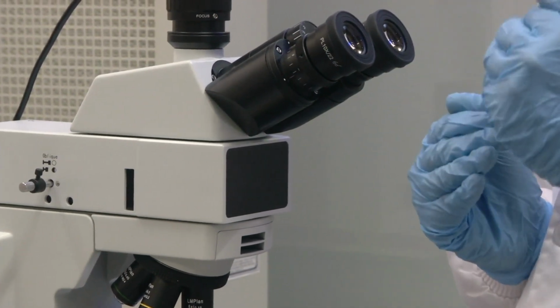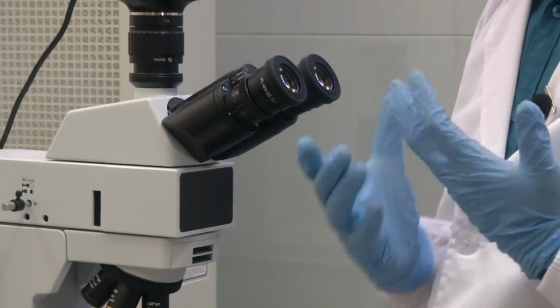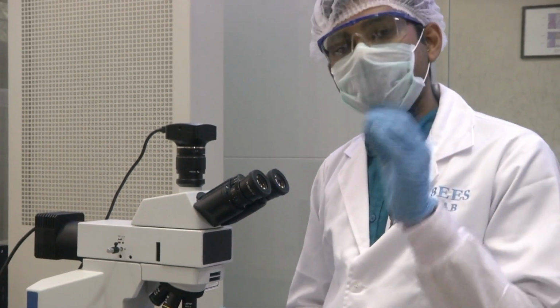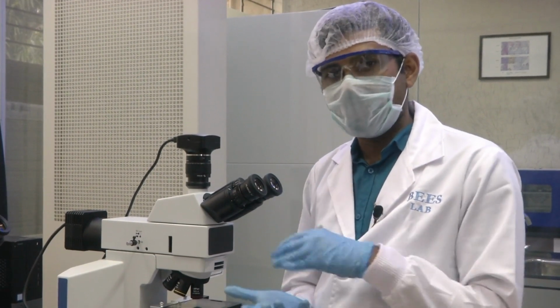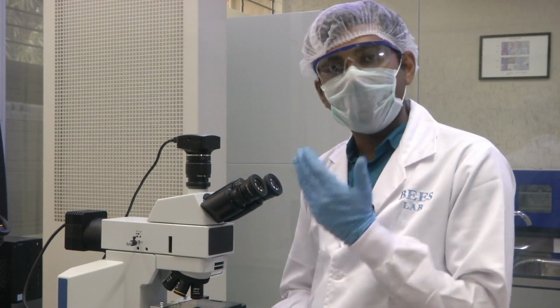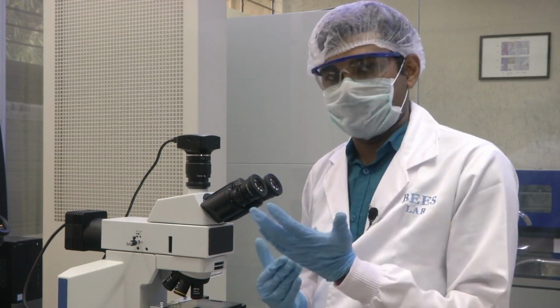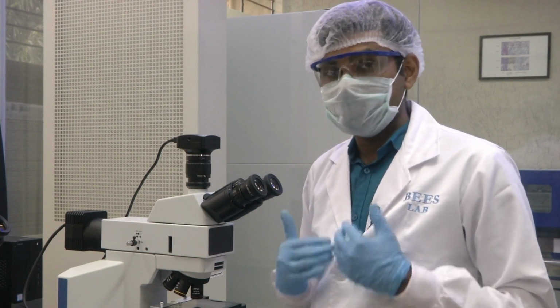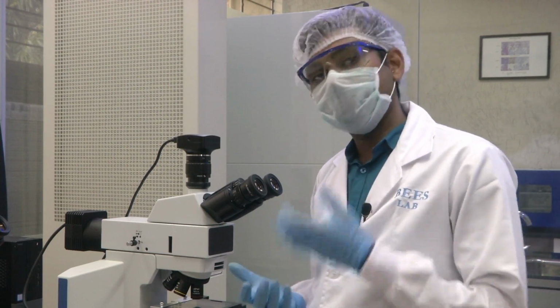There is a subclass of microscopy, fluorescence microscopy. What happens in that? Let us say we have a sample and we add a particular chemical to the sample. What that chemical does is, it goes and interacts with some particular feature of that sample in such a way that after interacting, that particular sub feature of the sample emits a particular light. So, it starts emitting light. What is fluorescence? Fluorescence is when a substance starts emitting light. So, when it emits light, we can capture that.